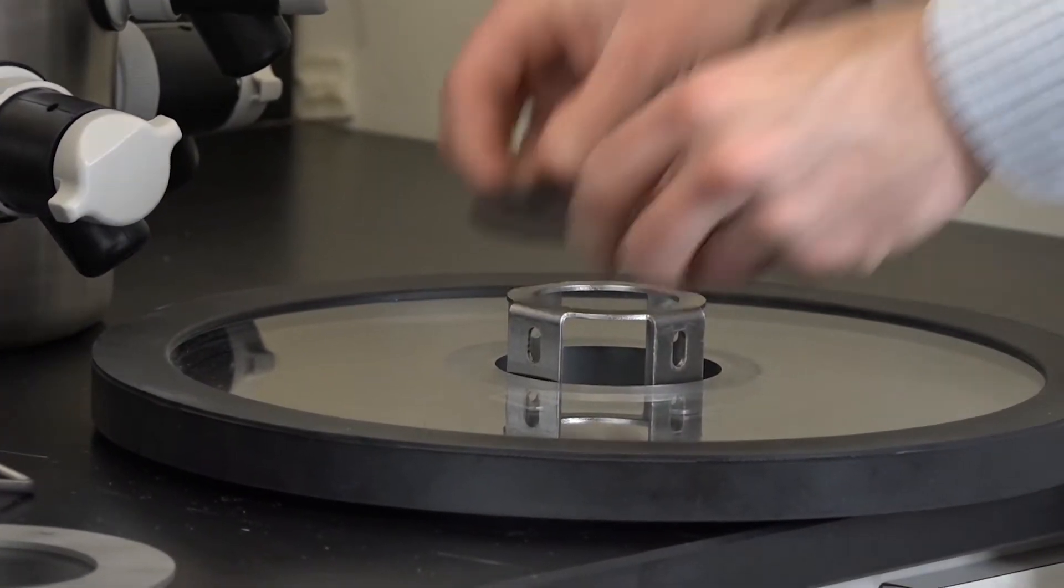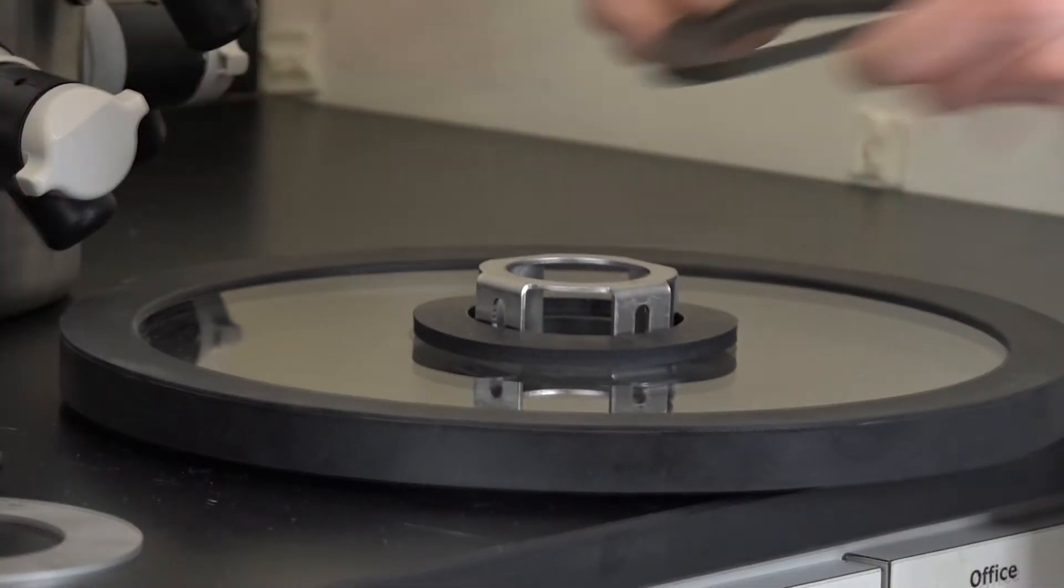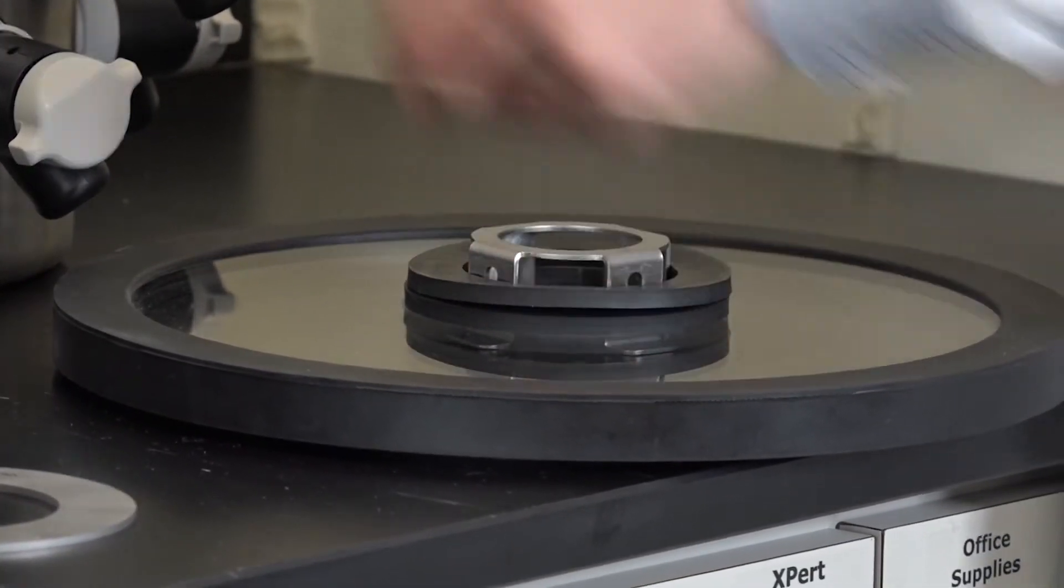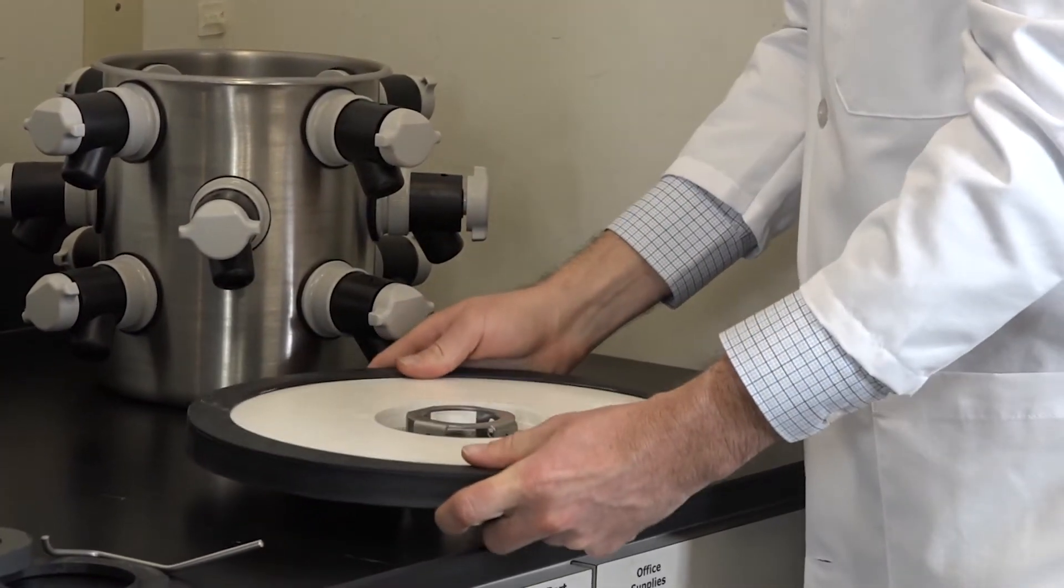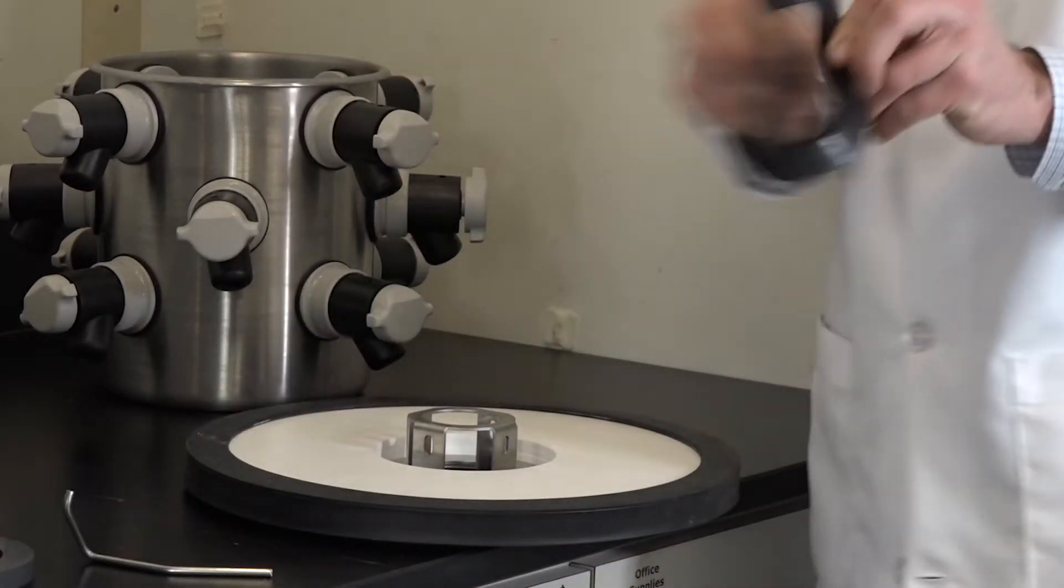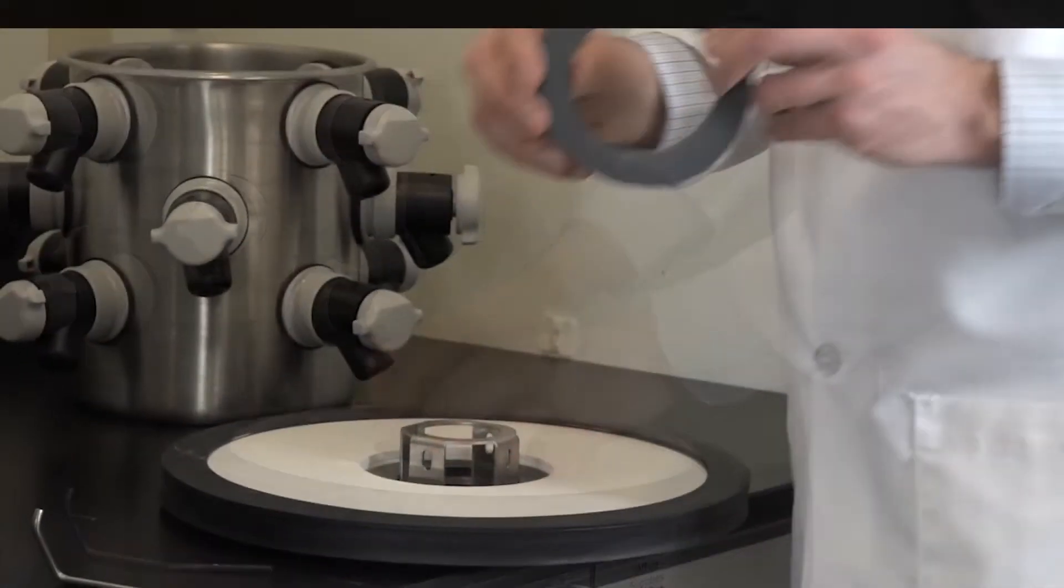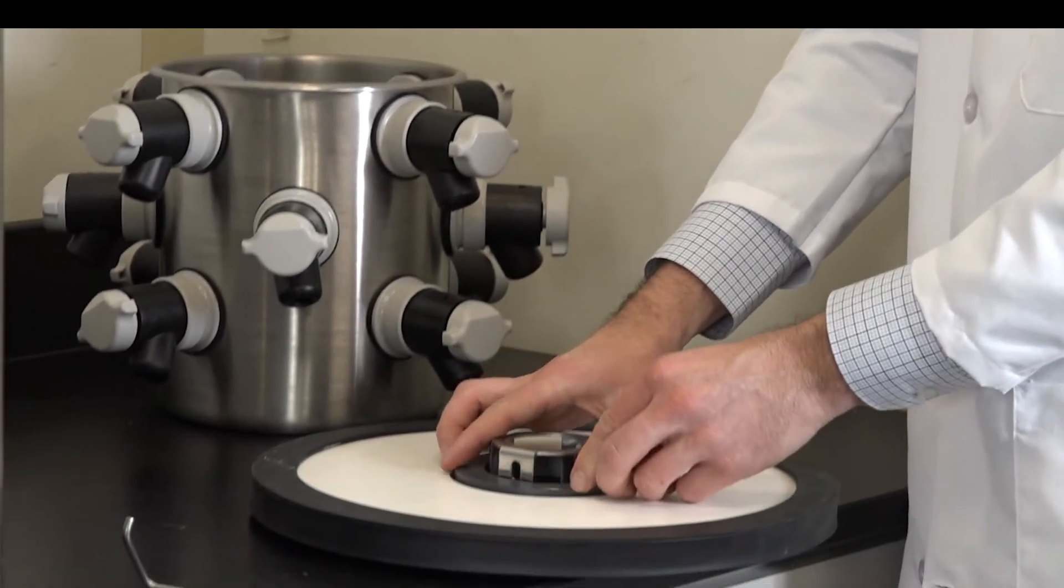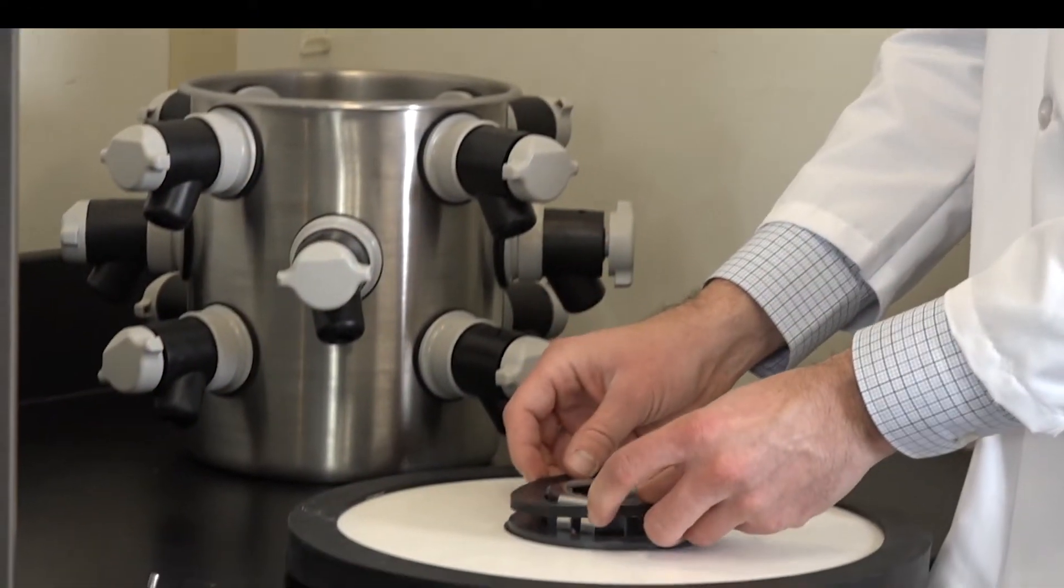If the collector lid is acrylic, place two gaskets over the collar. If the collector lid is stainless steel, place a gasket, acrylic spacer, and another gasket over the collar.